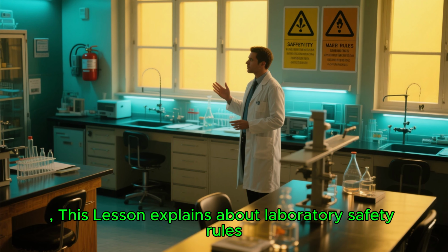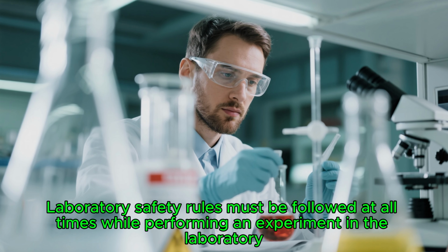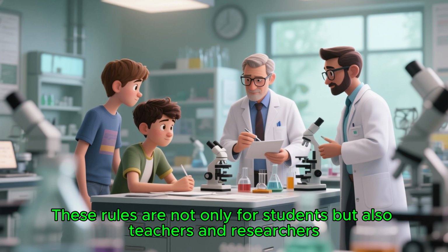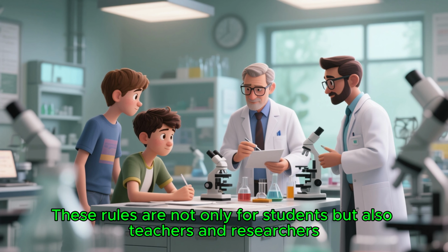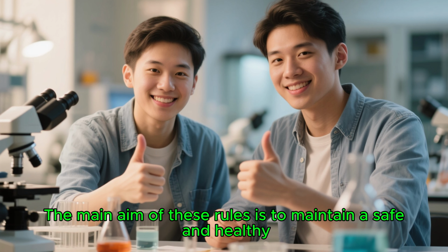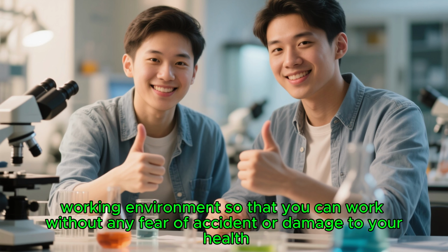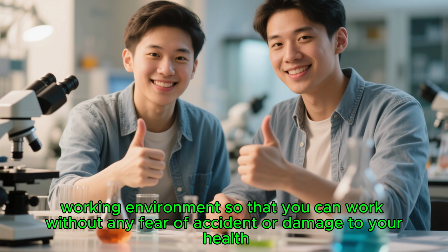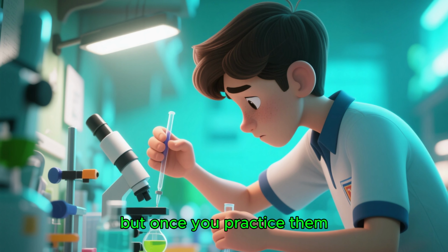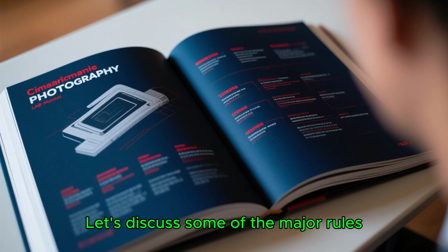This lesson explains about laboratory safety rules. Laboratory safety rules must be followed at all times while performing an experiment in the laboratory. These rules are not only for students, but also teachers and researchers. The main aim of these rules is to maintain a safe and healthy working environment so that you can work without any fear of accident or damage to your health. At first, it may seem difficult to follow these rules, but once you practice them, they will become second nature to you. Let's discuss some of the major rules.